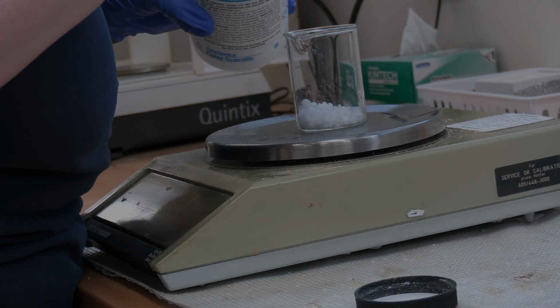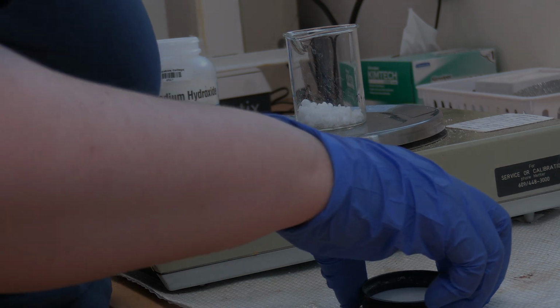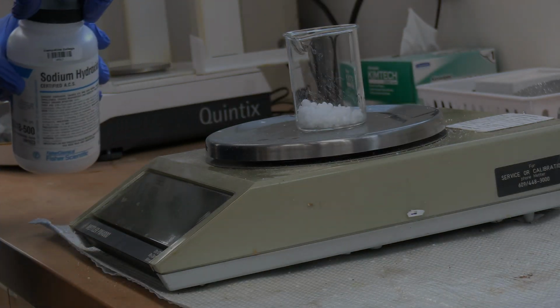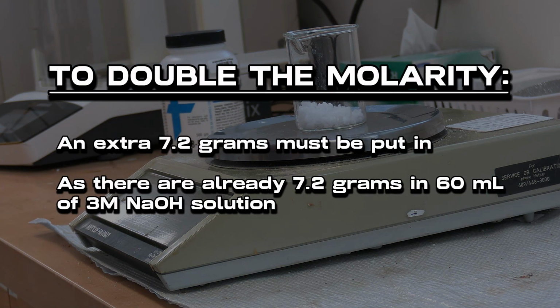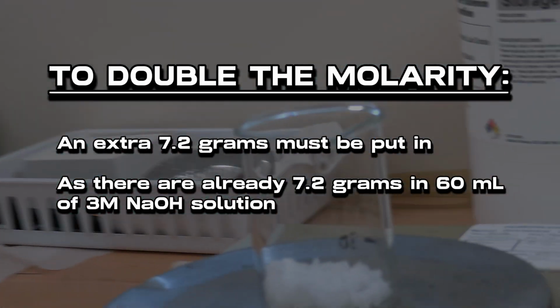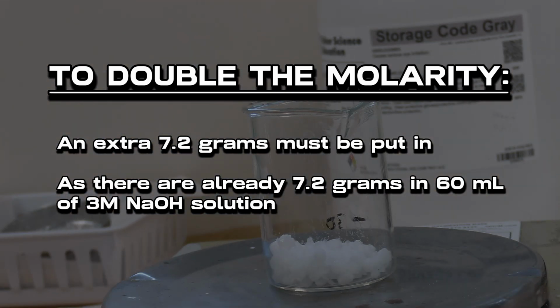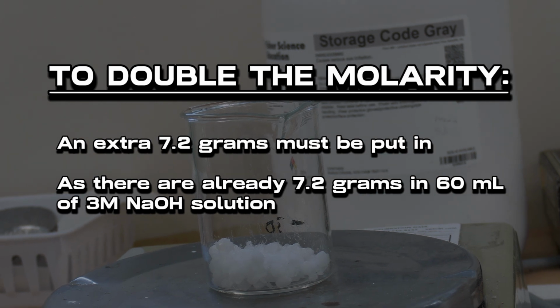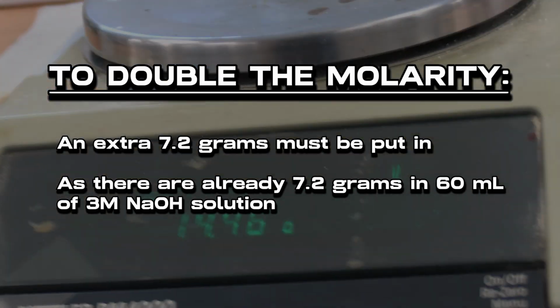Since I'm working with 2 different molar concentrations of NaOH, once I have used my 60 milliliters of my 3 molar solution, I will add more solid sodium hydroxide to increase the molarity of the remaining 60 milliliters. To double the molarity of this solution, since it already contains 7.2 grams of solid NaOH per 60 milliliters of water, 7.2 more grams of sodium hydroxide must be added. This is because 6 molar sodium hydroxide requires 6 moles per liter of solution, and 14.4 grams of sodium hydroxide is needed in total for 60 milliliters of water.